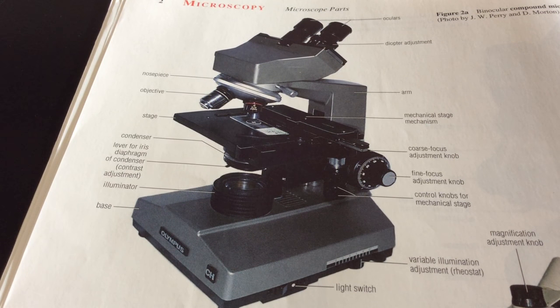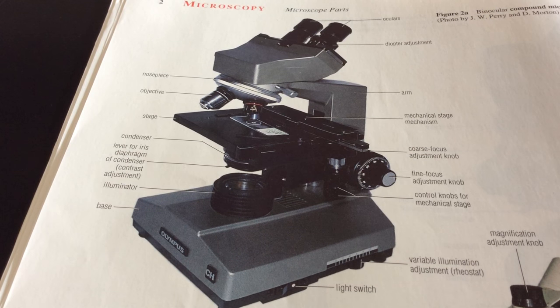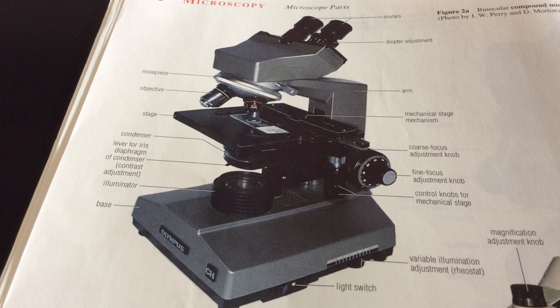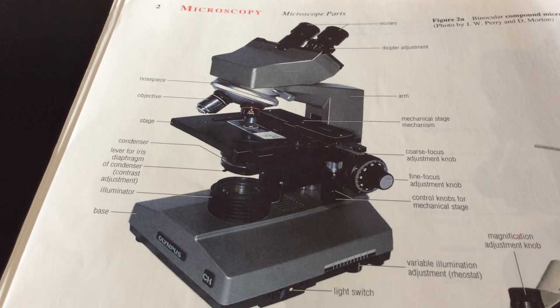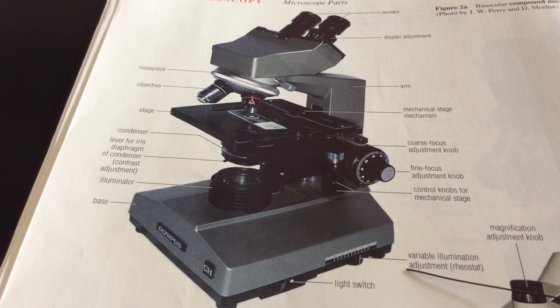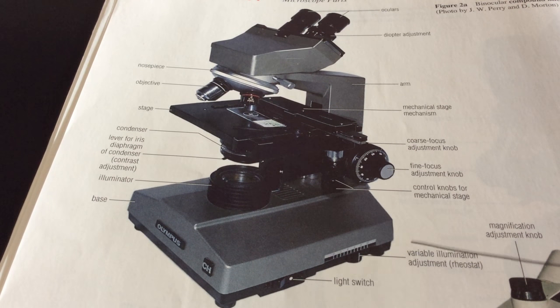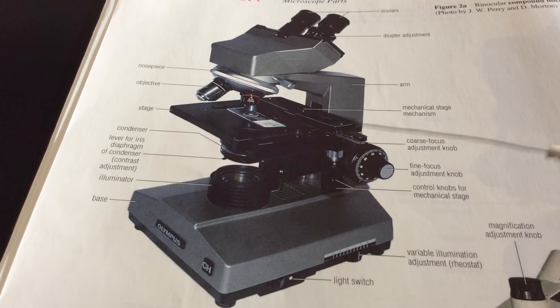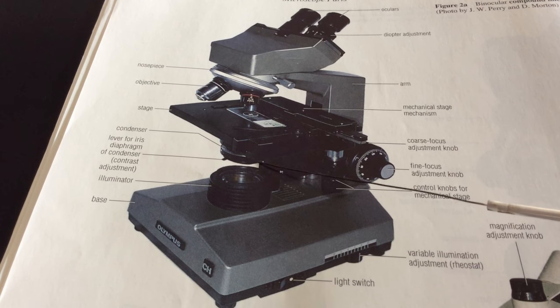So again, to increase resolution, we need to deliver as many photons of light to our retina. We want to make as many action potentials as possible. So when we're trying to increase resolution, the clarity of the outline of our microbes, we want to increase light, and there's a couple of ways we can do that. We can increase the variable light control. For example, on the oil immersion lens, we might be working at the highest setting, say setting 10. We can also open up the iris diaphragm lever to increase the amount of light striking our specimen and thus reaching the eye.